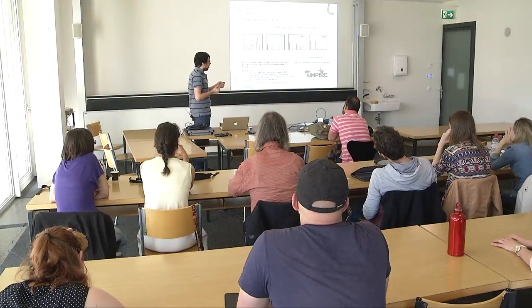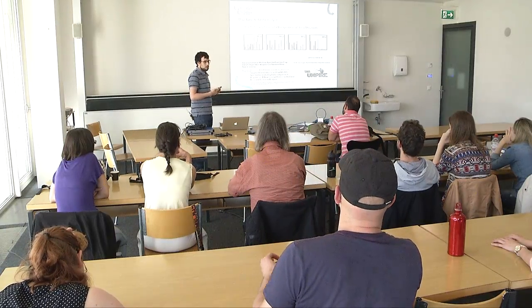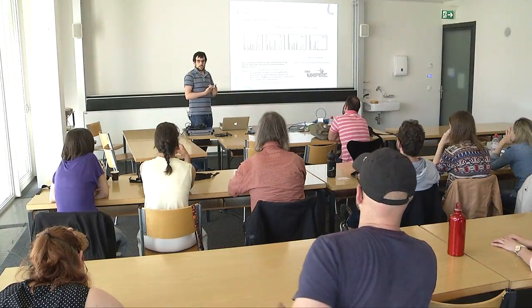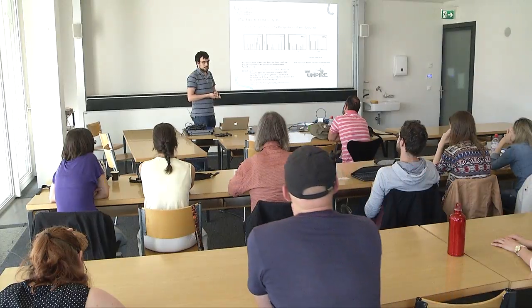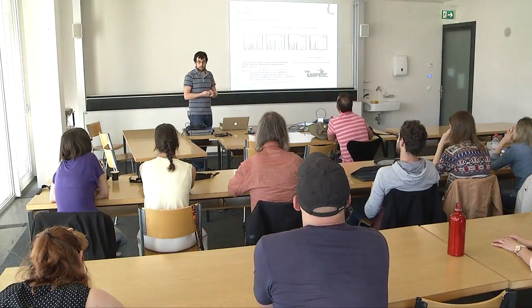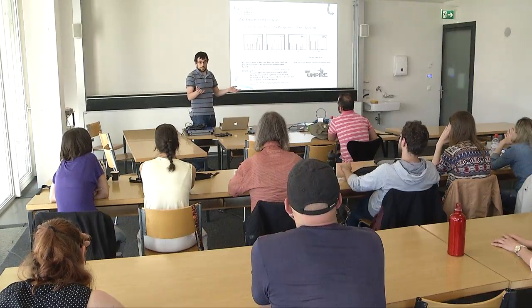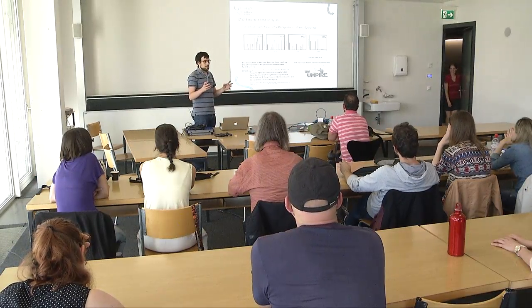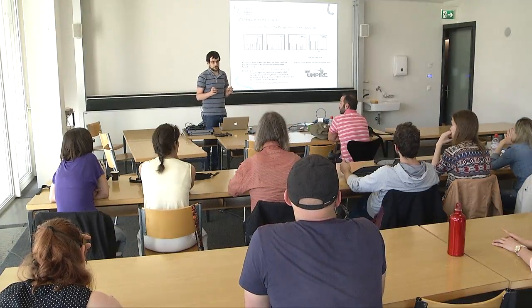In this case, and this was also commented in one of the talks before, we mine or query the SWATH data, data-independent data, not in a targeted form, but we take all this data and ask, what is in there? Coming back to a similar approach to what we were doing in shotgun, okay?